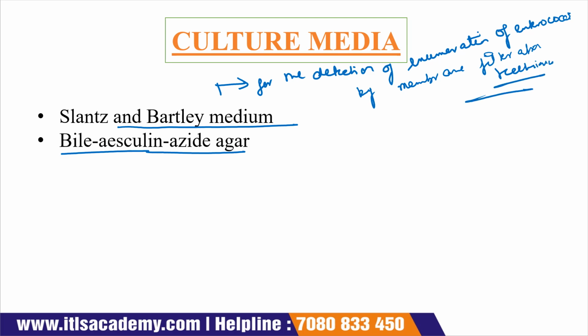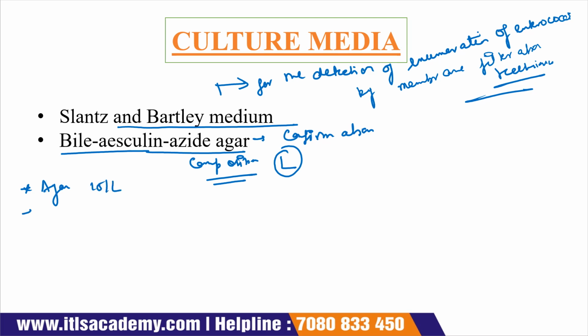But the next agar that we use is bile esculin azide agar. It is used for confirmation. And the composition of this bile esculin azide agar, I'm going to give for 1 liter. So they contain agar 15 gram per liter. Next is esculin, 1 gram per liter.